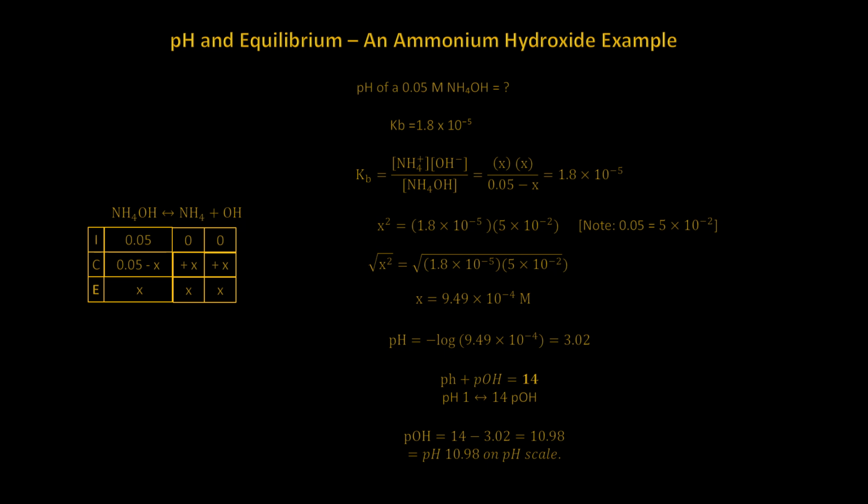This method of pH determination is useful when an ammonium solution or other solution is created, and a pH meter or some litmus paper is not readily available to be used.